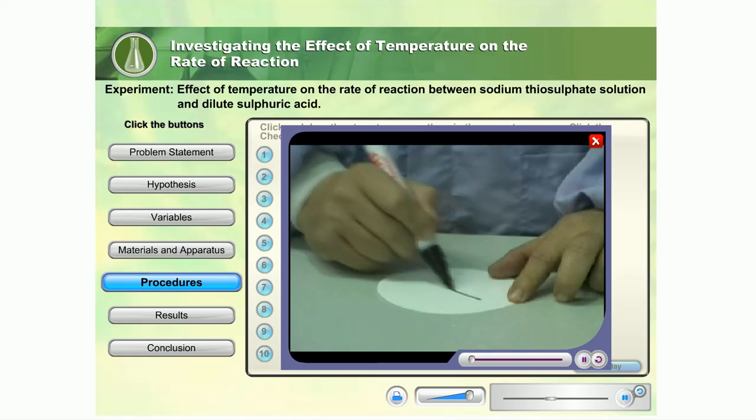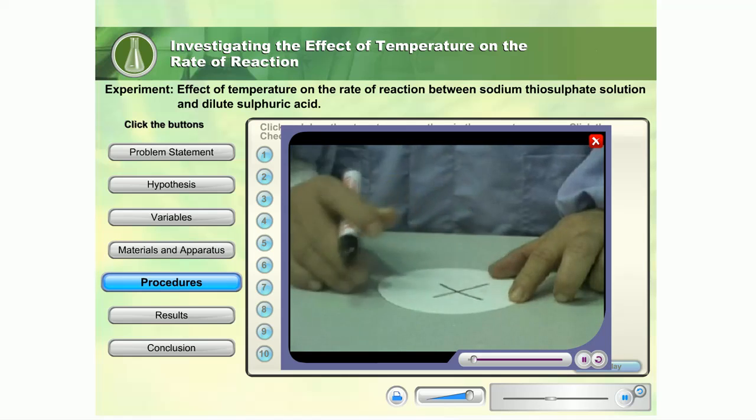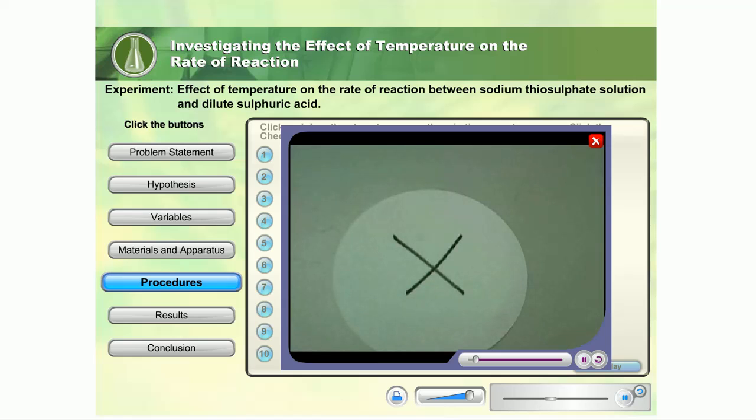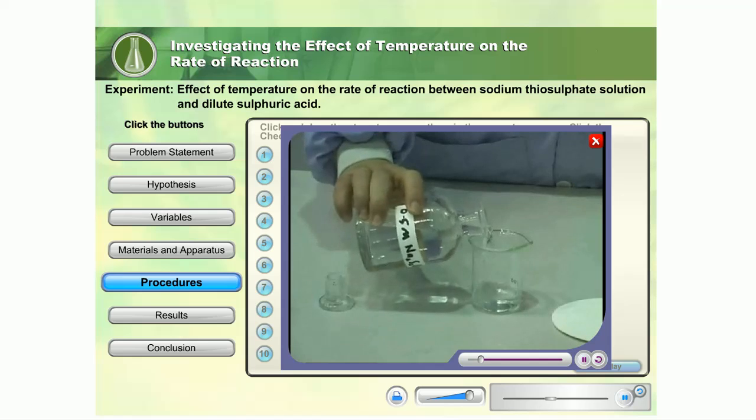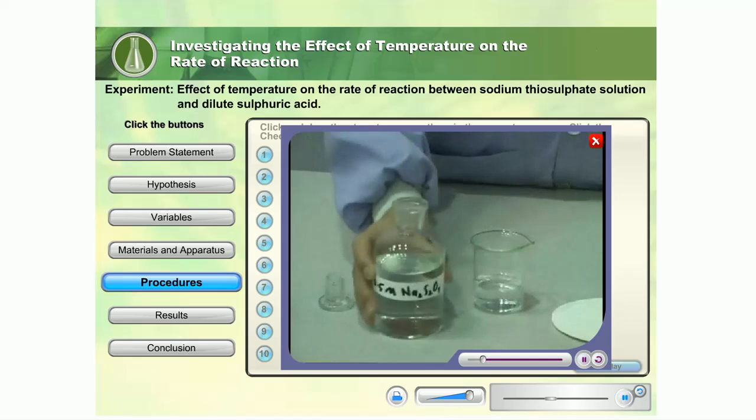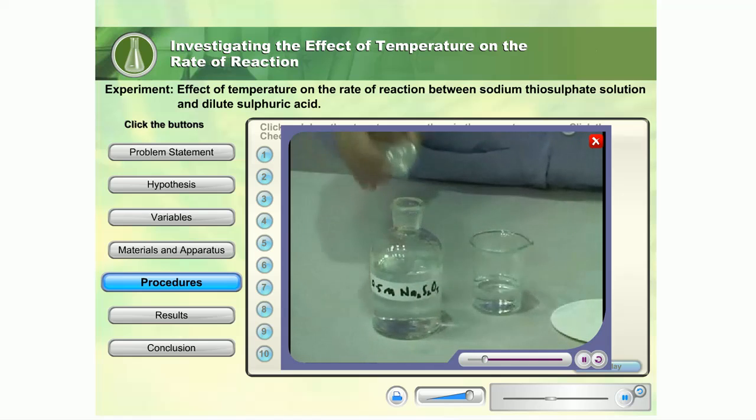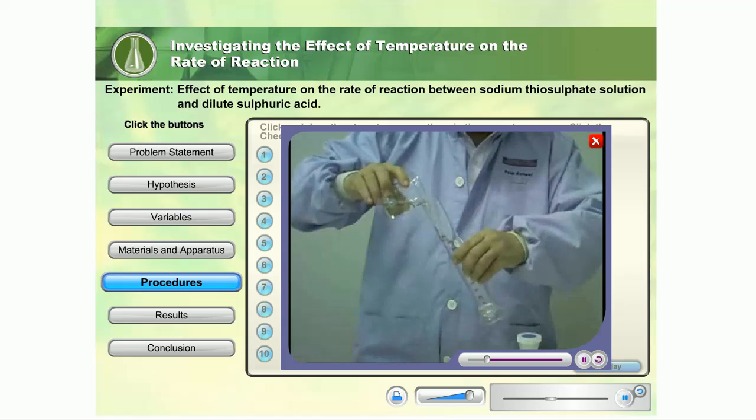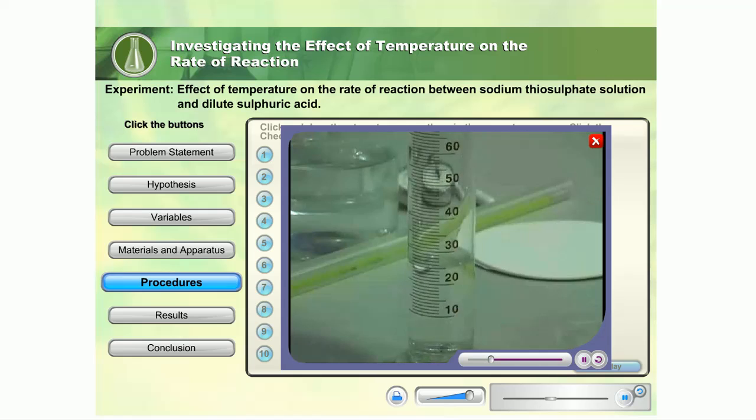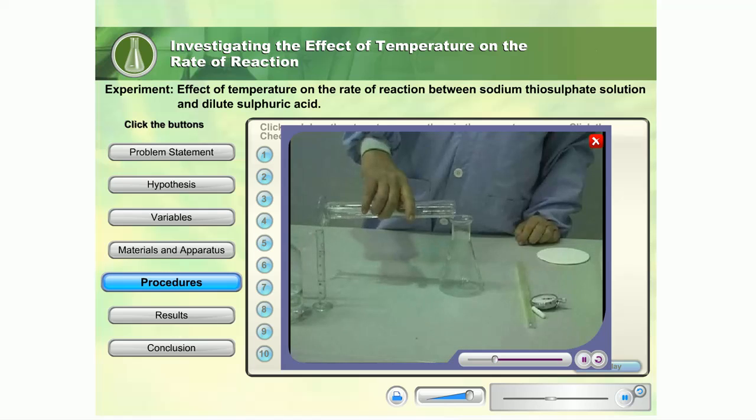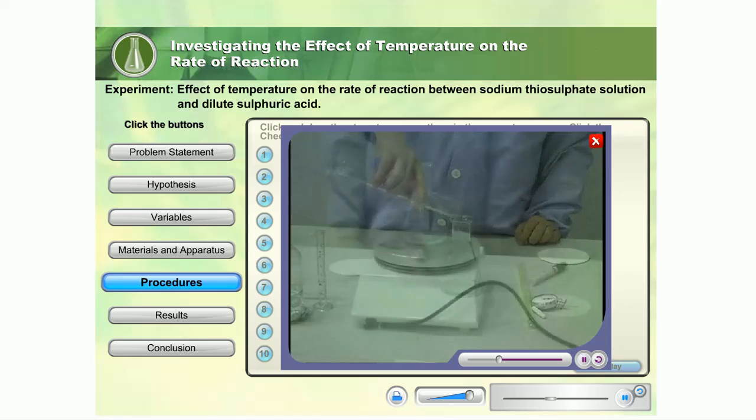Draw an X about 2 x 2 cm in the center of a piece of white paper. Measure out 25 cm³ of 0.5 mol per cubic decimeter sodium thiosulfate solution using a 100 ml measuring cylinder. Pour the sodium thiosulfate solution into a clean, dry conical flask.